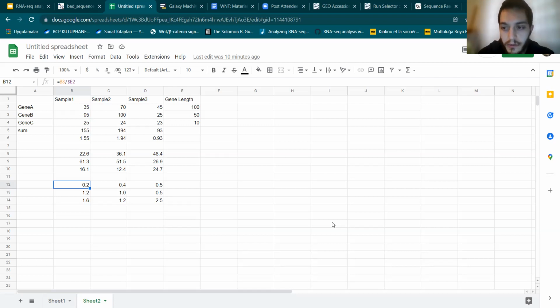Like there is a unique molecular identifier now, a method where they ligate it to the reads before the sequencing, which allows a better quantification of the reads. If you have any wet lab procedure that reduces the noise, the variability, it is important.